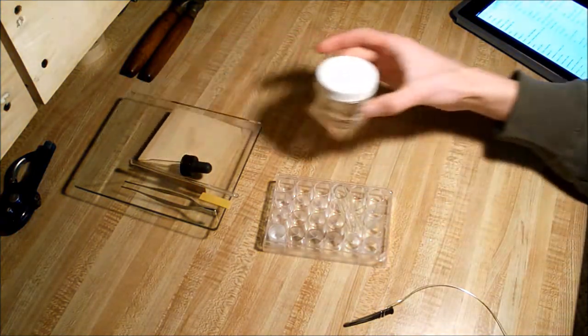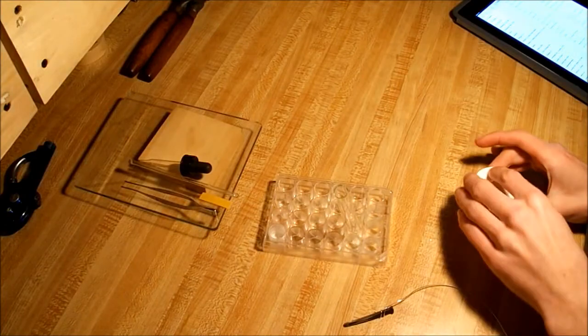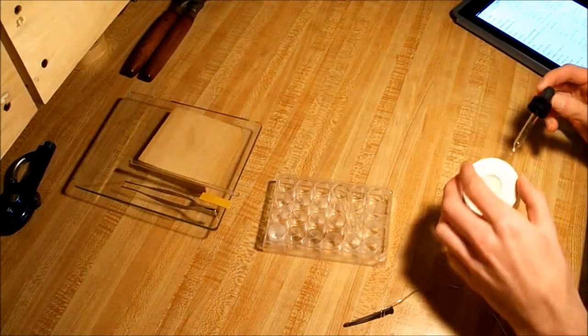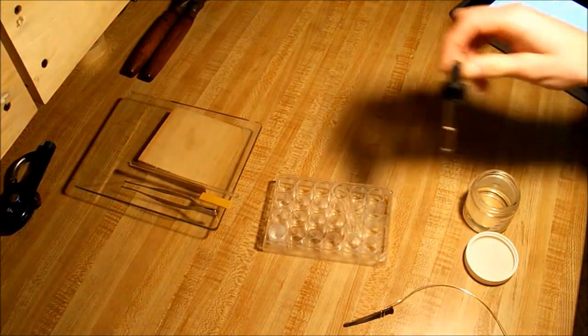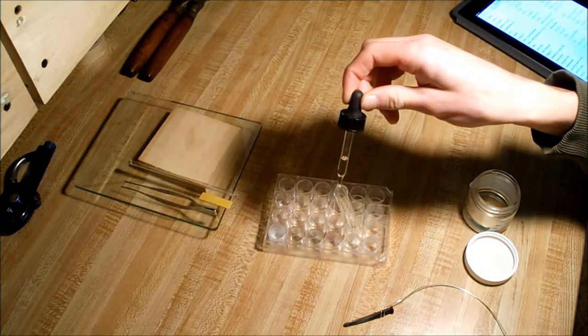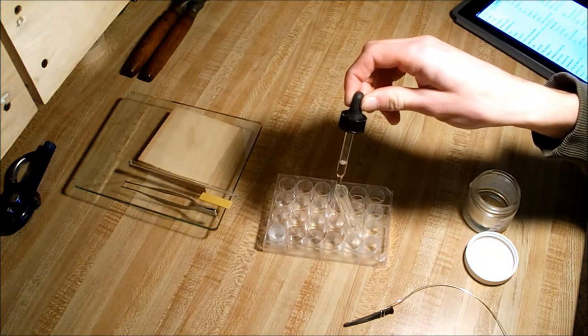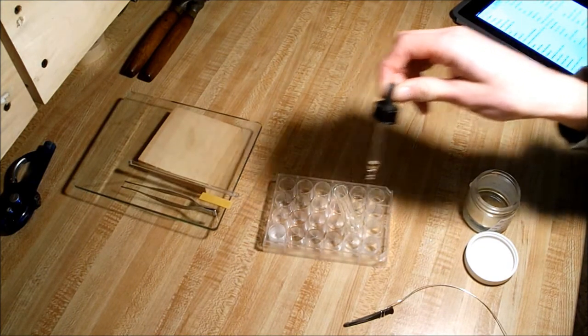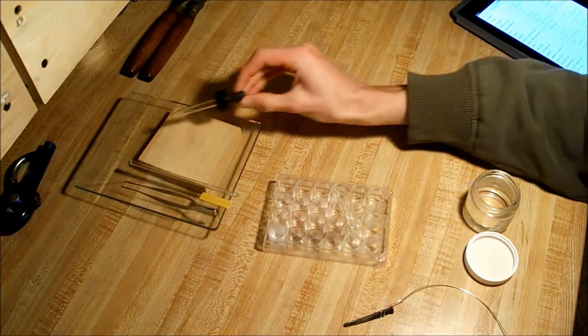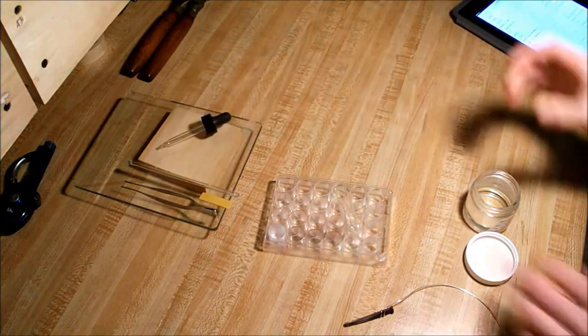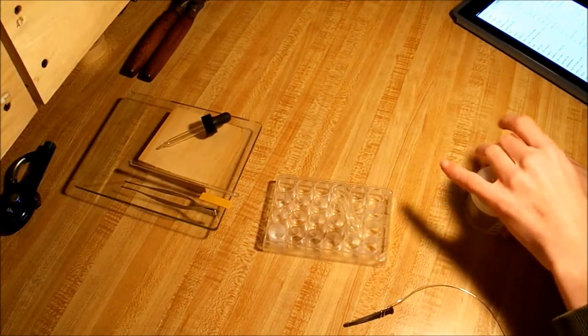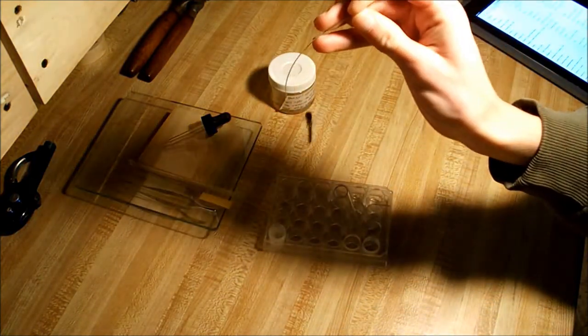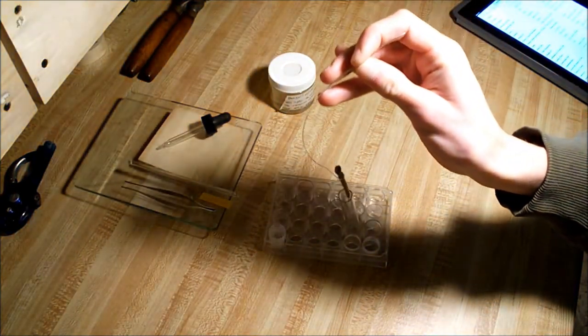Next you get your hydrochloric acid and a glass dropper or dispenser. I generally add 10 drops hydrochloric acid into the test tube. Then we place our nail into the acid solution.